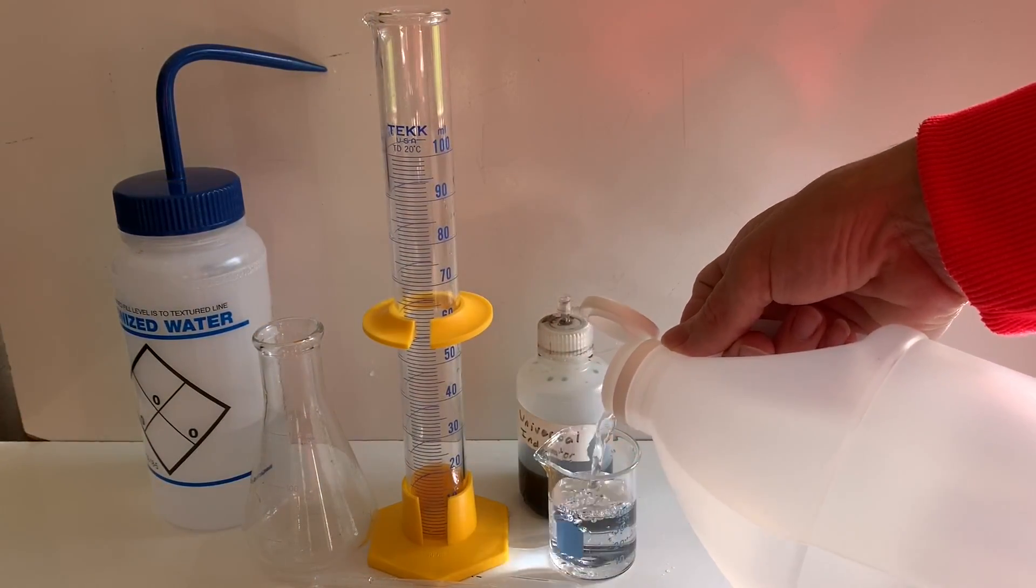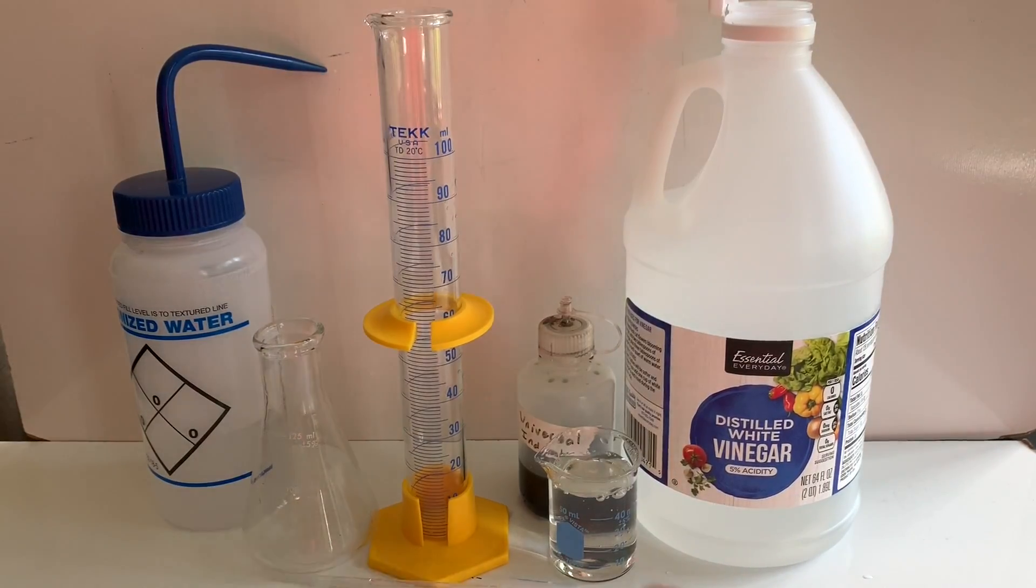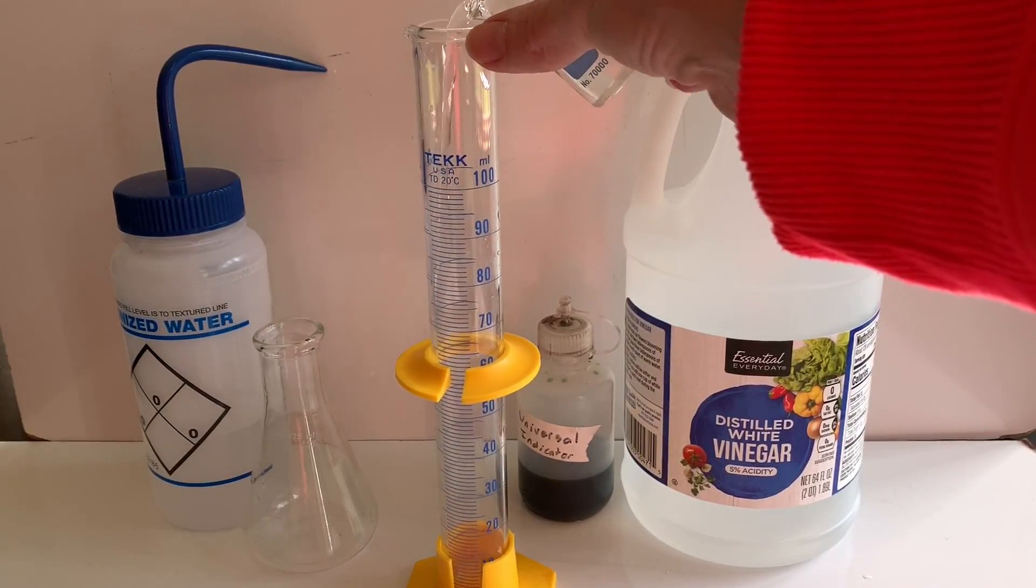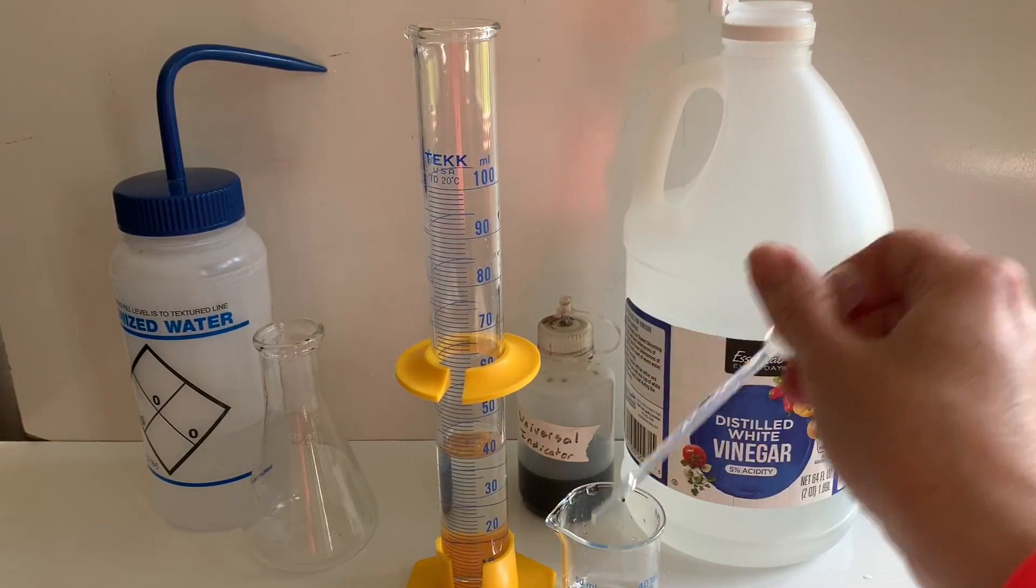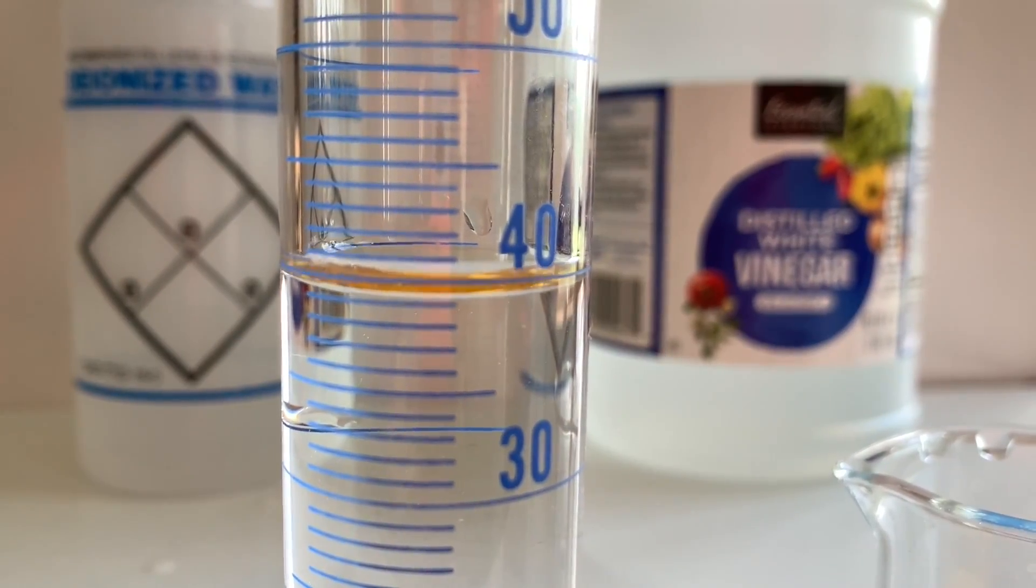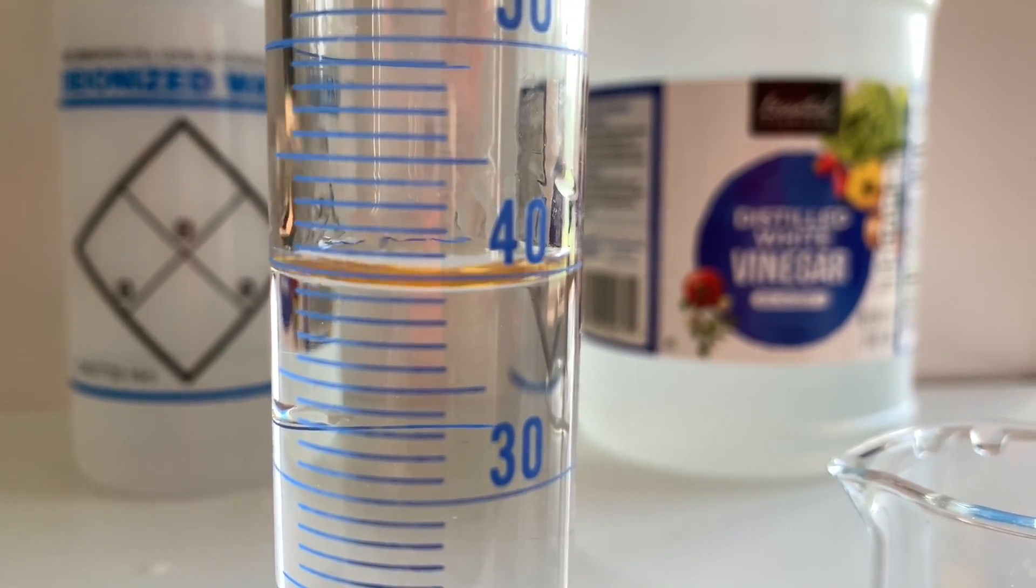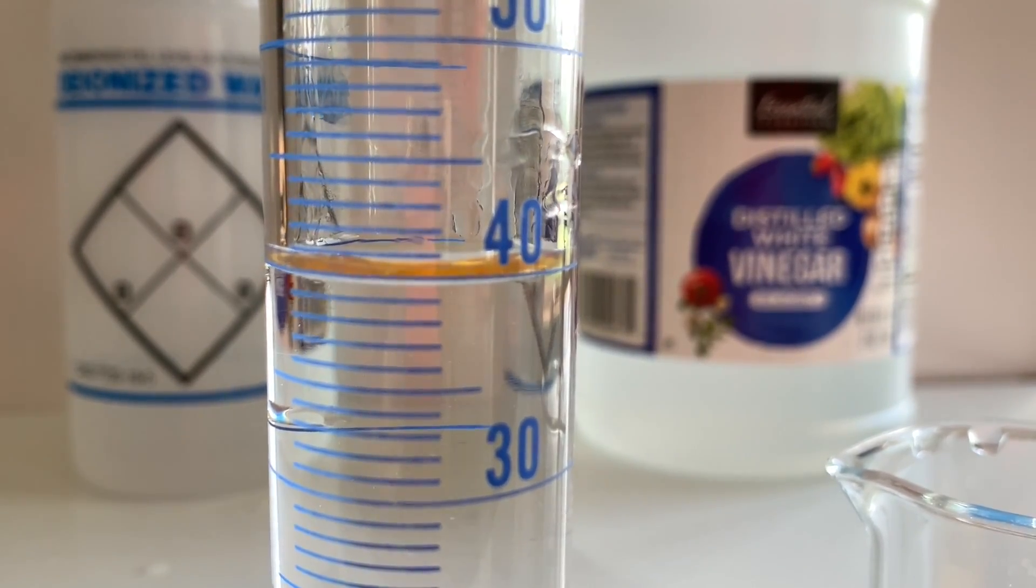The next step of the experiment was to measure 40.0 milliliters of the acetic acid solution which was 0.839 molar. I wanted to make sure I had exactly 40.0 so I need my meniscus right on that 40 line on the graduated cylinder.